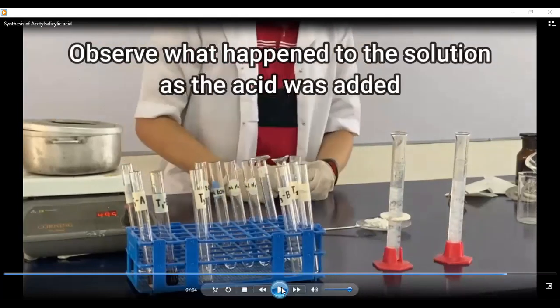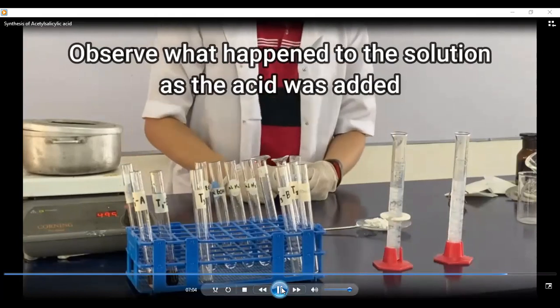For this chemical test, the positive result should be the presence of a cloudy precipitate, which is true. Both solutions had a cloudy precipitate. The one on the left is the lab available.